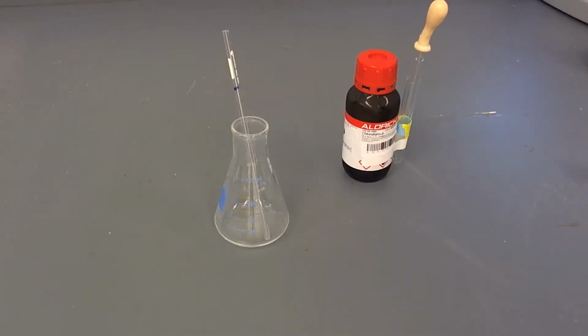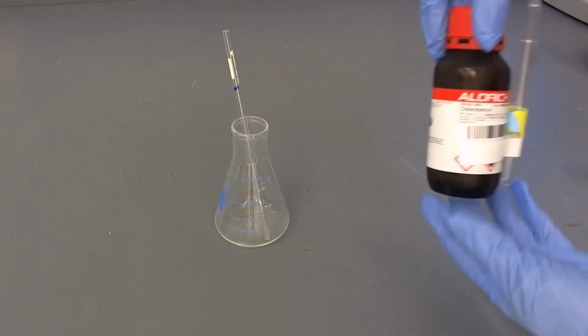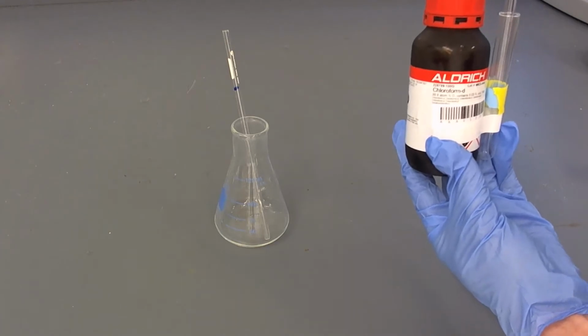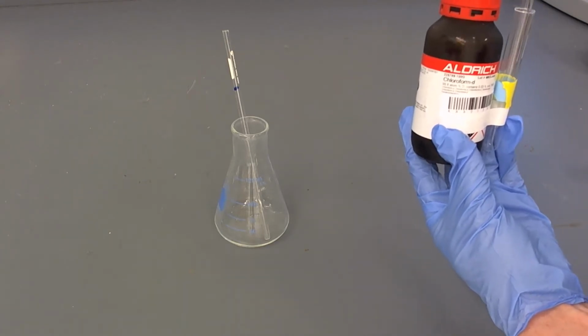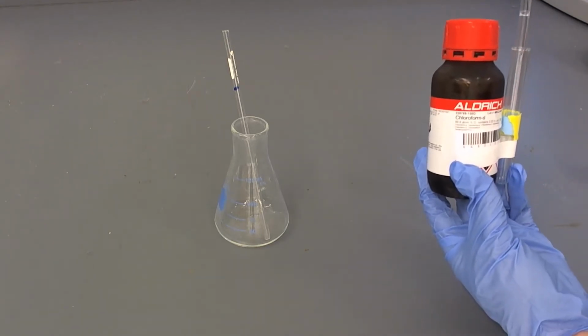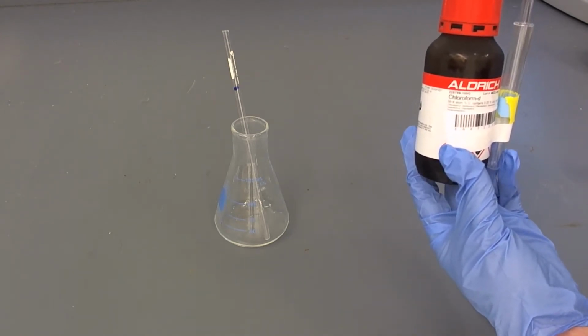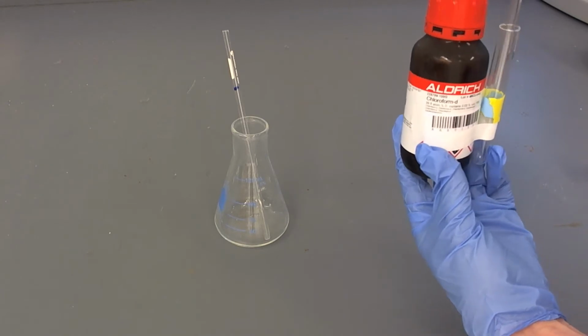Let's go over how to make up a sample for NMR spectroscopy. Let's look at liquids first. In any situation, we need deuterated solvent. The solvent, the main portion of the sample, does not have protons that will be seen in the NMR spectrum. So we use deuterated chloroform, in which the proton has been replaced by deuterium, so chloroform D.